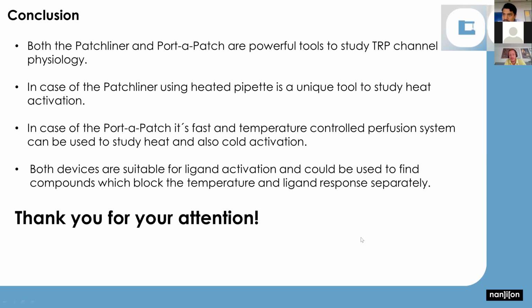Initially, the first question, András, regarding TRPM8, are you planning to do ligand activation? Yes, I didn't show it yet, but this is already tried, but of course we're going to repeat it, and we will do it in more detail, how to apply it. So yes, we are going to do it.